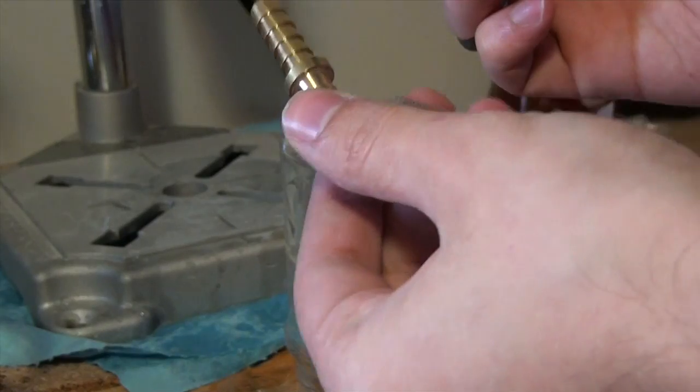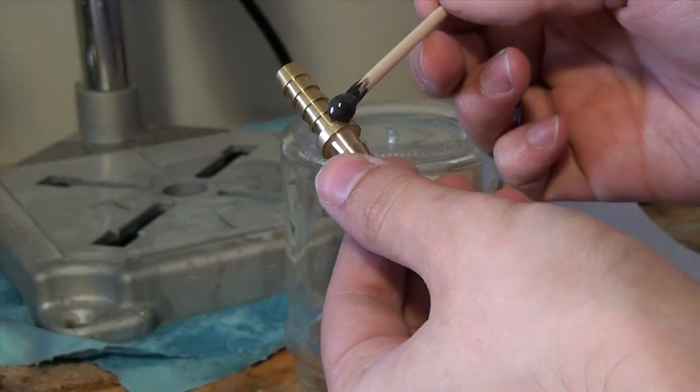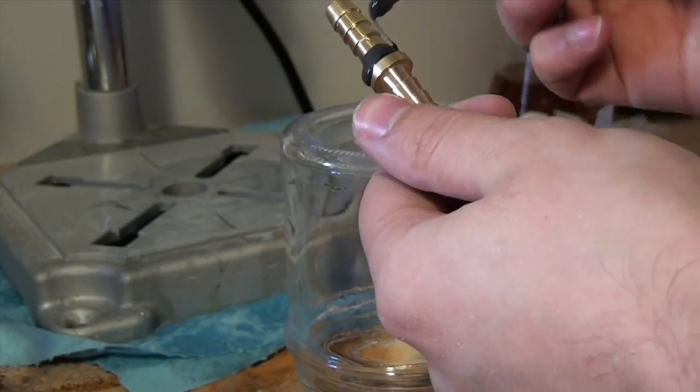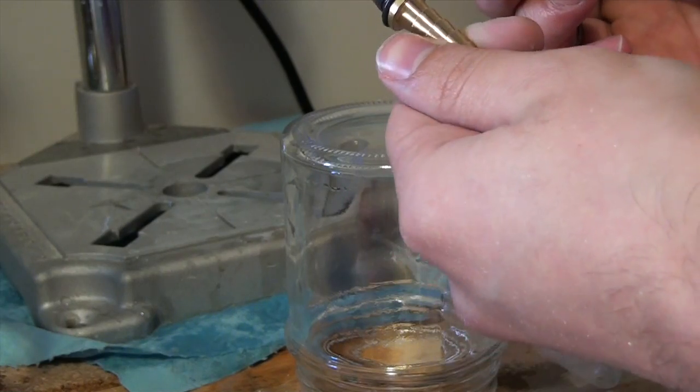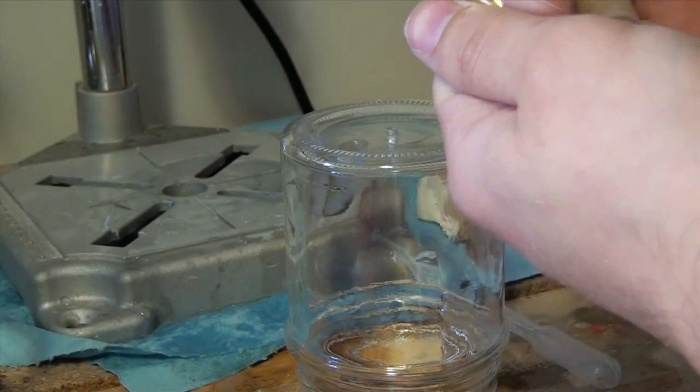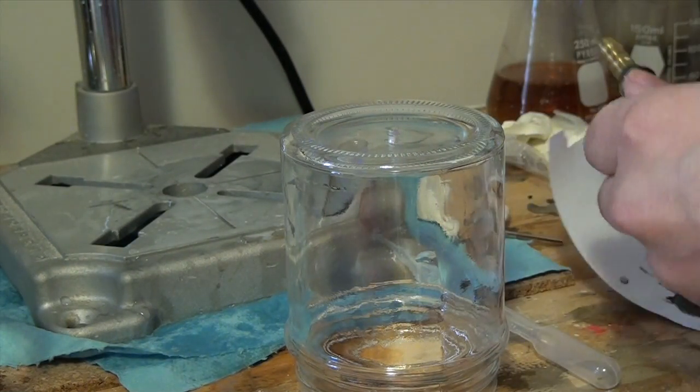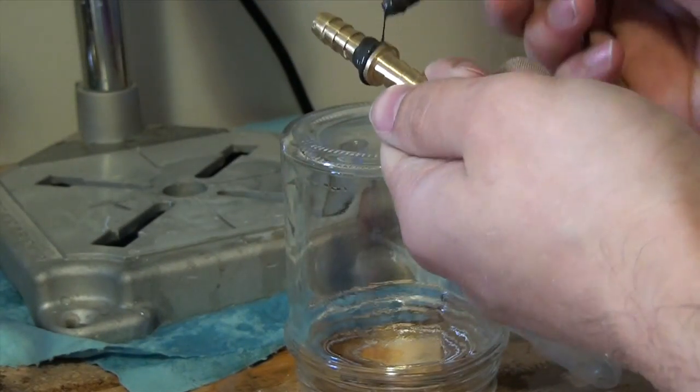Now all that's left to do is to epoxy everything up. I'm just using a quick set JB Weld. Honestly, JB Weld is like the duct tape of the vacuum world. This stuff works amazingly to seal pretty much any leak you have and it can take a fair amount of abuse.